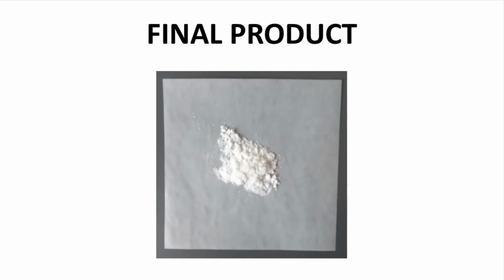Here is the final product. It was scraped off of the filter paper and out of the Buchner funnel. That compound in the middle of that weighing paper has a mass of 334 milligrams and is a very pretty white solid.